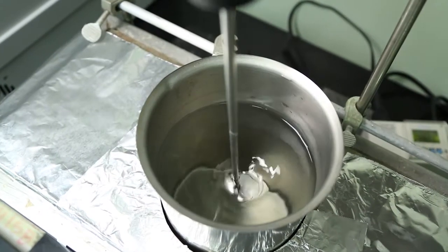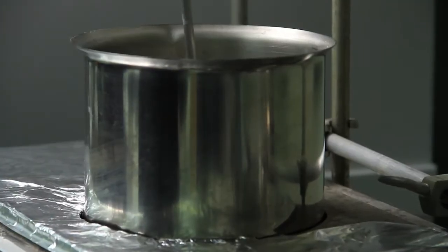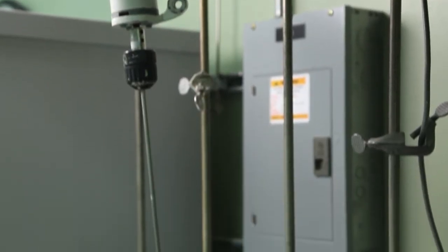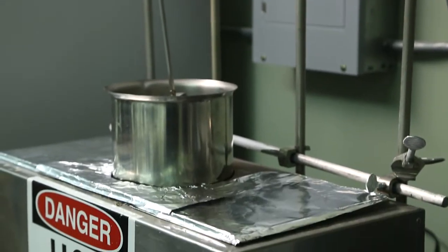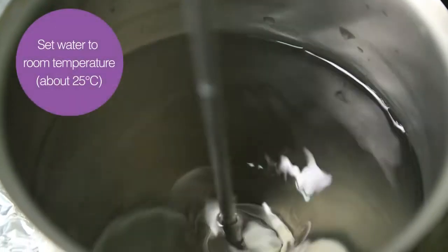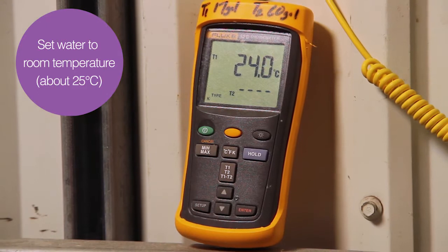The preferred heating method for dissolving Selval Ultilux is by steam jacket. Direct steam injection or electrical heated jacket can also be sufficient. Begin with water at room temperature, about 25 degrees centigrade.